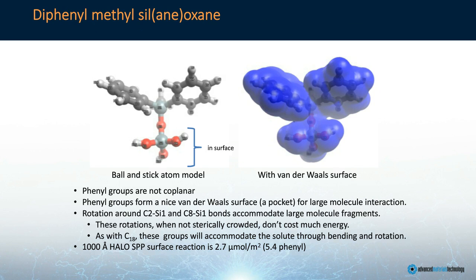The diphenyl phase has been characterized using computational models. These were done in-house by Mark Shore, who some of you may be familiar with. The idea was to understand how this phase may be interacting with these larger biomolecules.